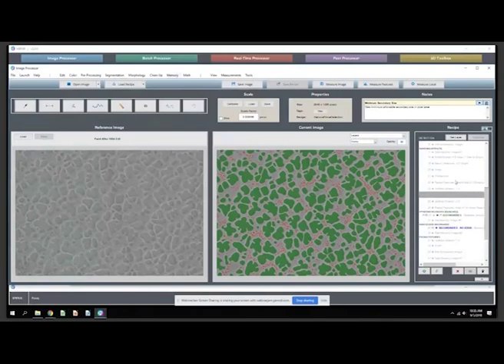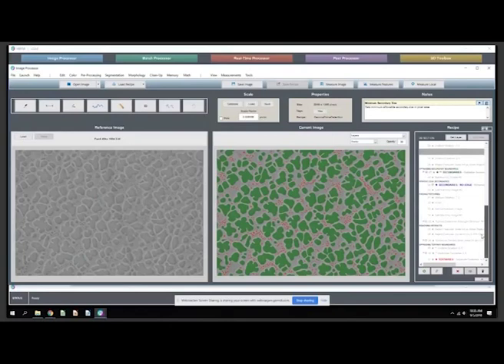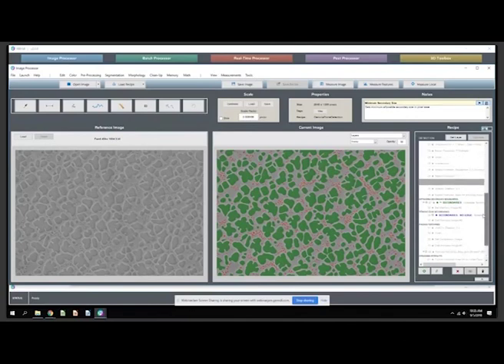You click a step, it adds to the recipe. You can go all the way up to step 2 and make a change and hit accept, and the other 39 just repeat for you. You can remove a step at any point. You can insert another one. It's intended to get the software out of the expert's way and just let them solve the problem. And that's why we've been able to solve these problems as quickly as we have for as many of our clients as we have. So that's an insight to the recipe.